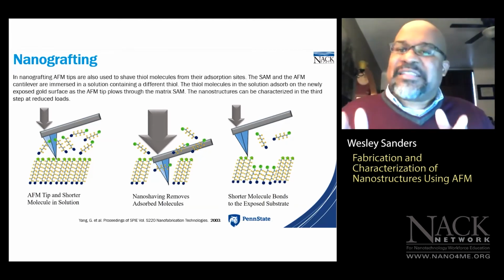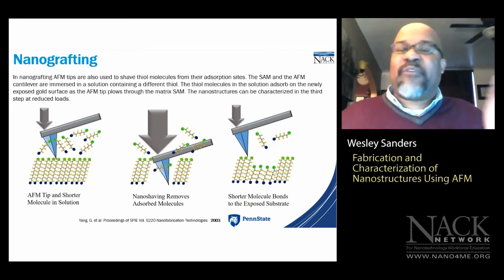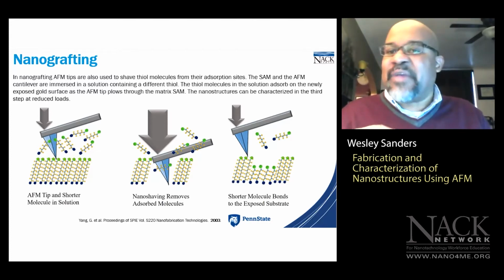So when you send the DC pulse in one configuration, you will have an expansion. And if you reverse the polarity and then apply your voltage pulse, then you'll have a contraction, right? So we use a scanner with piezoelectric actuators to move the tip across the sample surface.